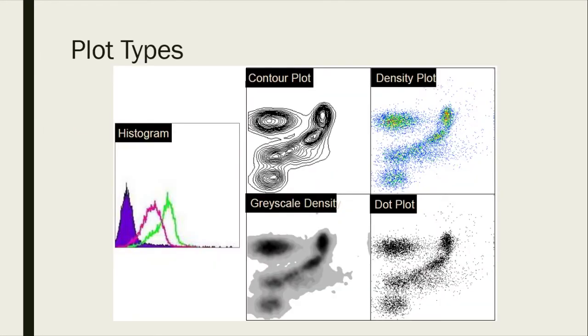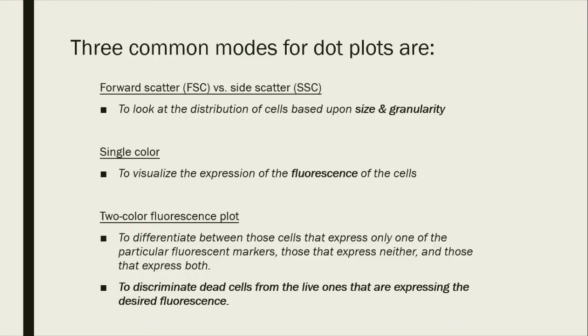Now, you don't need to go crazy about it. This is just an example of the idea of how these signals are being generated visually. The denser it is, the more stuff it looks like, that means there's more cells. And these histograms really are to tell you, at that particular fluorescent signal, how many cells there are. The bigger the shift and the bigger the area under the curve, the larger the population. Now don't memorize these fine details, just a very general idea of understanding.